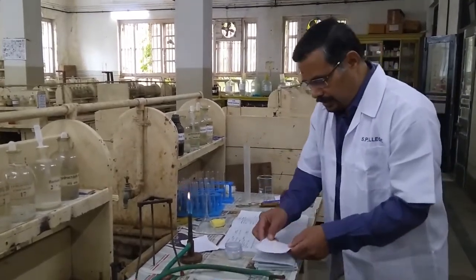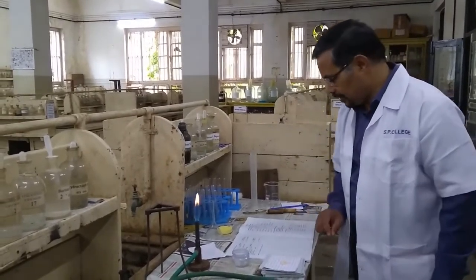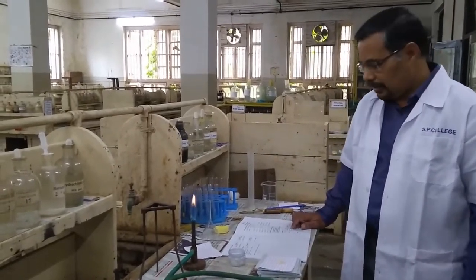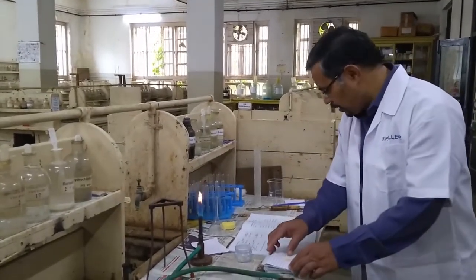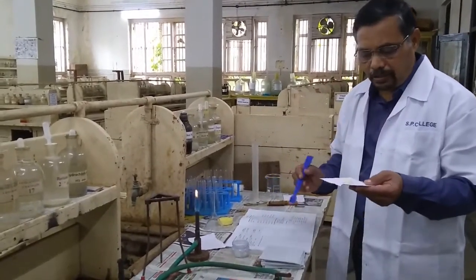Then we will study step by step analysis of this basic radical mixture. So the first step in the analysis of this basic radical is preliminary test. So in the preliminary test we will observe first observation, that is color.